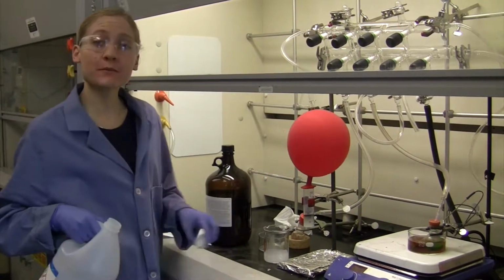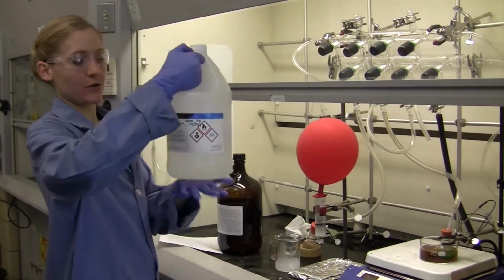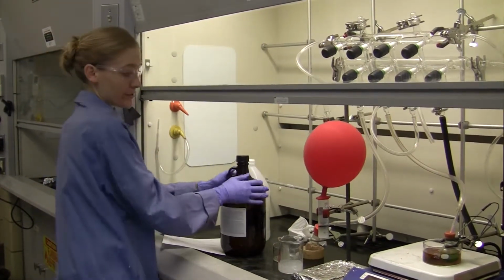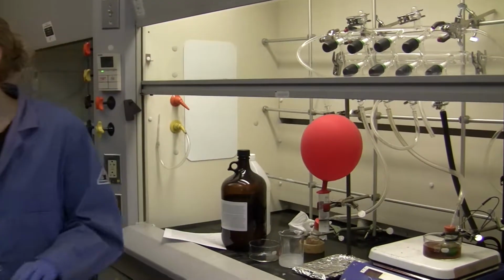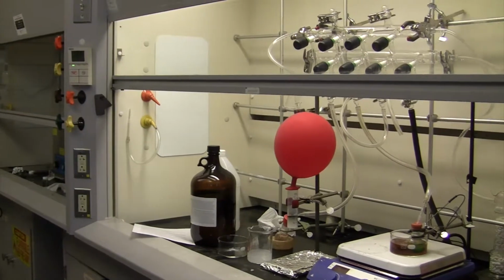So for a good precipitation, you want 10 times the volume of your bad solvent, in this case methanol, as your good solvent, which is chloroform. And then you just slowly want to add your solution.